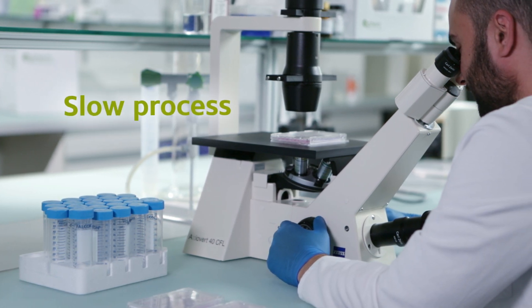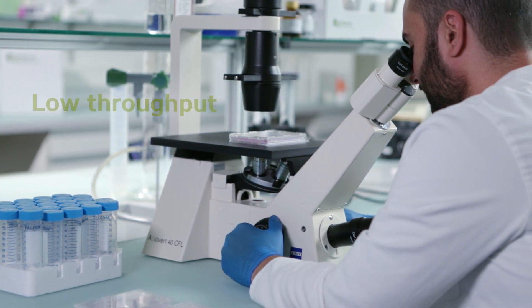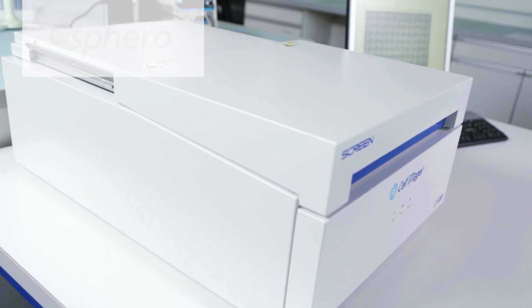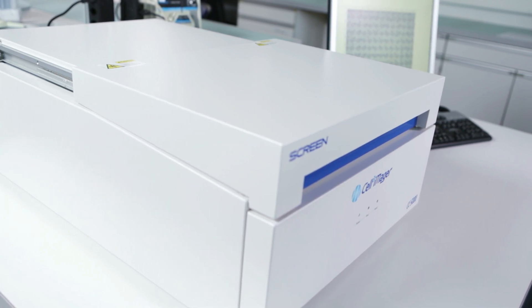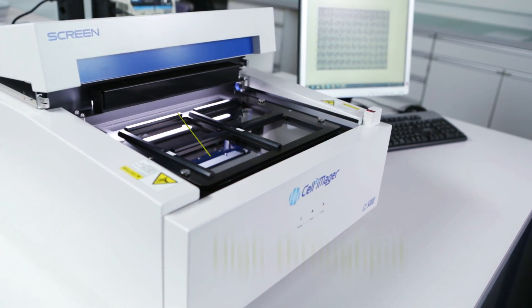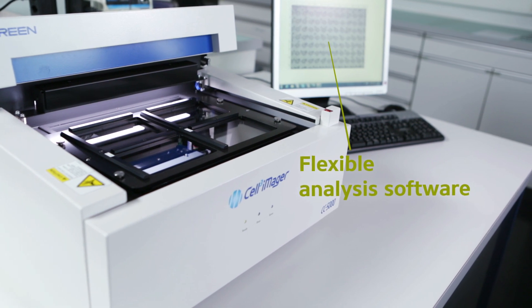Size analysis of 3D microtissues using conventional microscopes or high-content imaging systems has been a slow, low-throughput process — until now. InSphero, the world leader in 3D microtissue technology, has teamed with Dynippon Screen to introduce the Cell 3 Imager, which overcomes these limitations to provide fast, simple and label-free spheroid imaging.